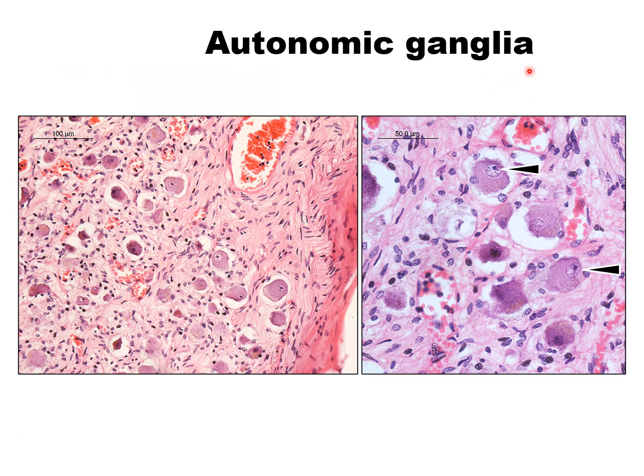This is a picture of the autonomic ganglia. You have seen the sympathetic trunk during the dissection of the thorax. It lies by the side of the vertebra. So if you take a section of these ganglia, these autonomic ganglia may be sympathetic ganglia or parasympathetic ganglia. The parasympathetic ganglia you have not seen till now. During the dissection of the head, face, neck, you will see the parasympathetic ganglia. So the difference between the sensory ganglia and the autonomic ganglia, you can see that neurons are there.